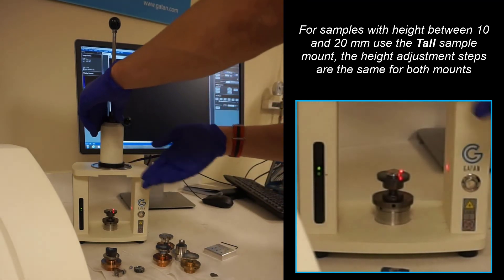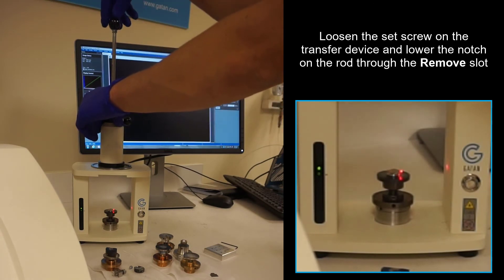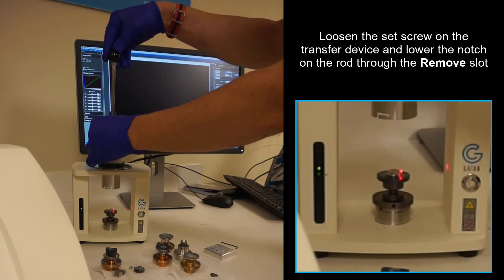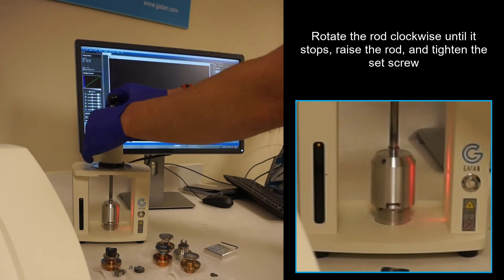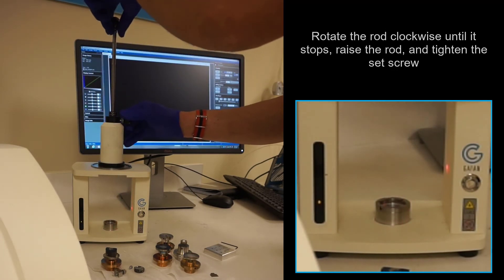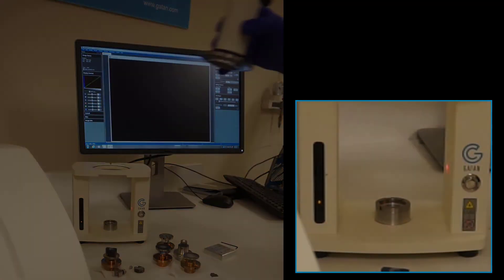Just like loading the alignment sample, we will now load this sample. Loosen the set screw, lower the shaft, pick up the sample, and now we're ready to insert the sample.